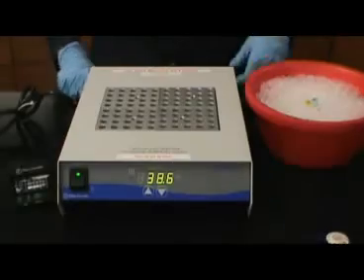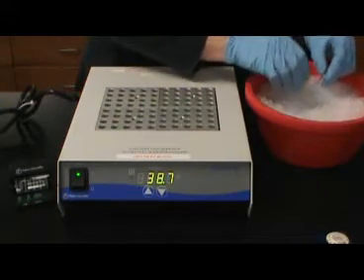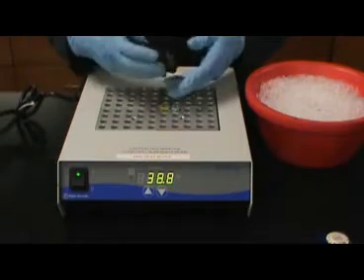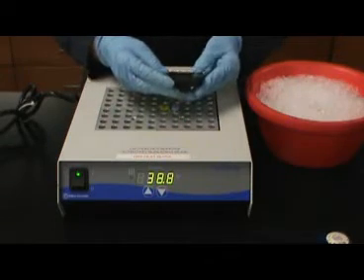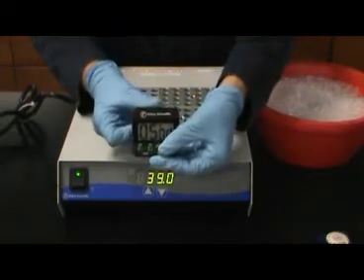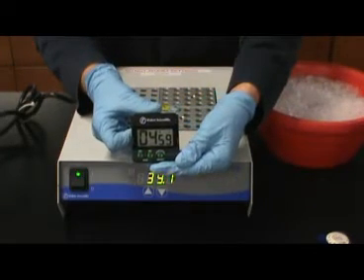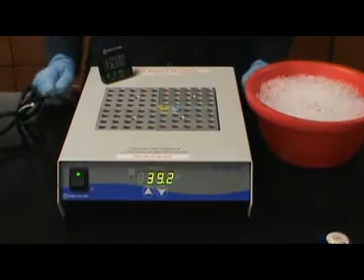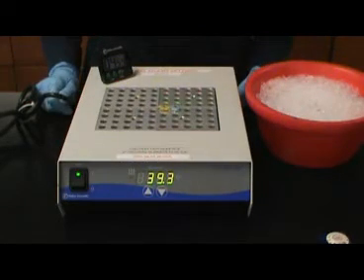After the tubes have been on ice for 15 minutes, place them in a heat block or water bath set to approximately 37 degrees Celsius for 5 minutes. This is known as a heat shock and will allow healing of the pores put into the bacterial cell walls and membranes by the cold calcium chloride.